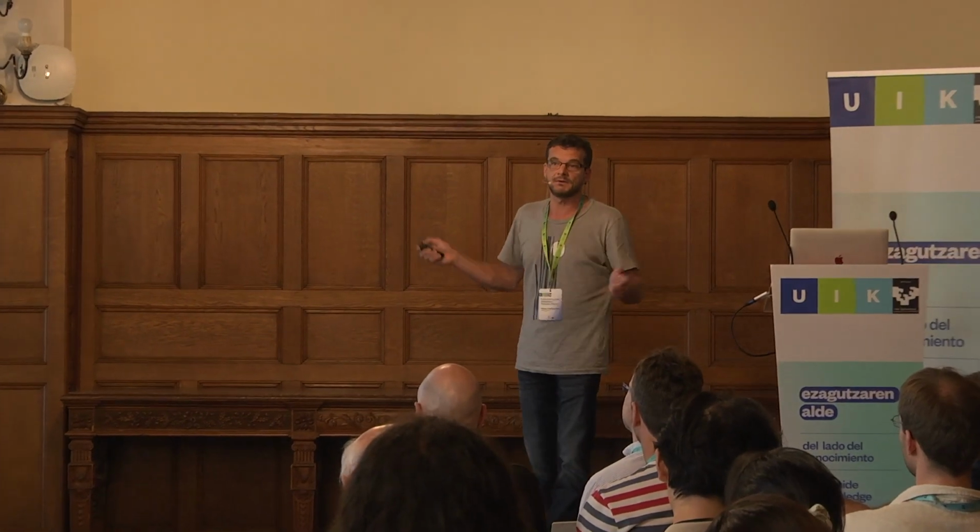Really, as I said, one of the ideas of this workshop is also to make very clear we know a little bit of s-SNOM, but there's a huge parameter space and knowledge space to be explored. I really don't know whether the geometry plays a role here. Probably, but I cannot tell you in which sense, okay?